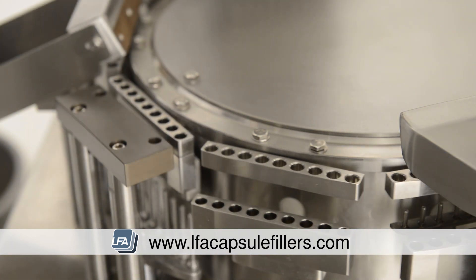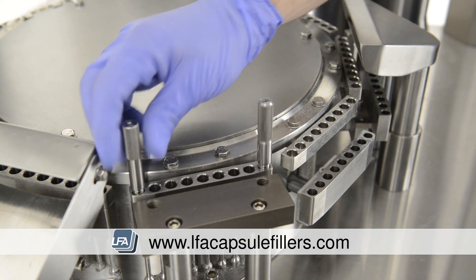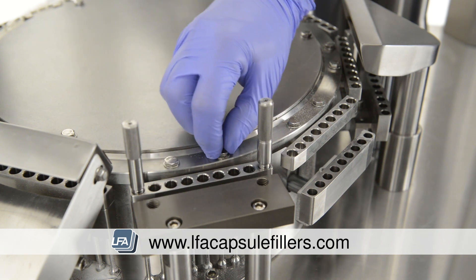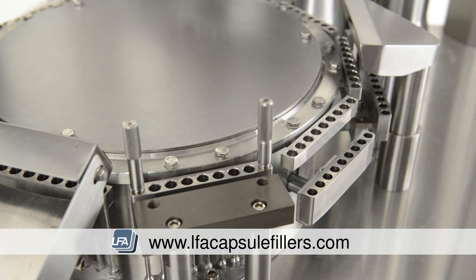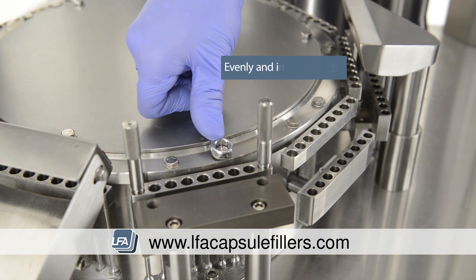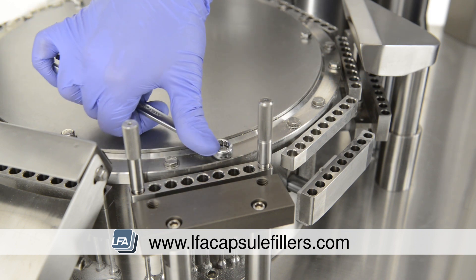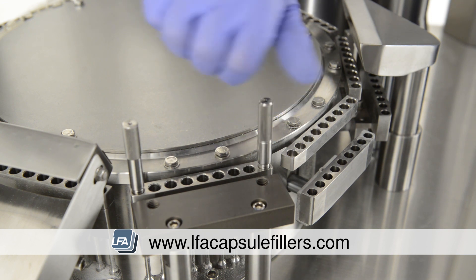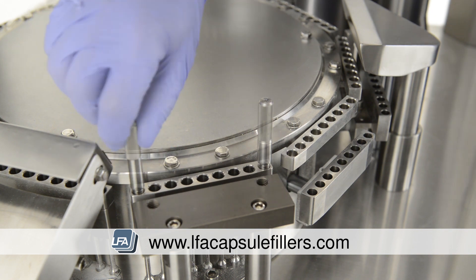Rotate the turret to bring the next station into position. Take your two alignment tools and place them into the end slots of the tooling to line up both the top and bottom sections. It's important they are placed in the end slots to ensure correct alignment. Then tighten the top section of the tooling evenly and in small increments. While doing this, check the alignment tools — they should always be able to drop and spin freely in the slots. Keep doing this until all the bolts are tight.